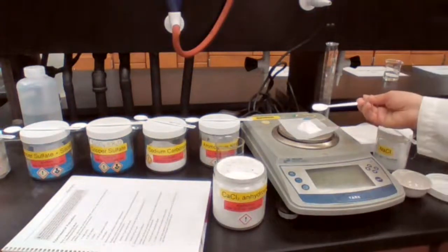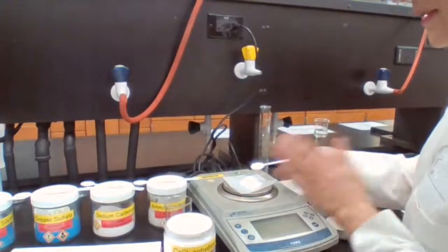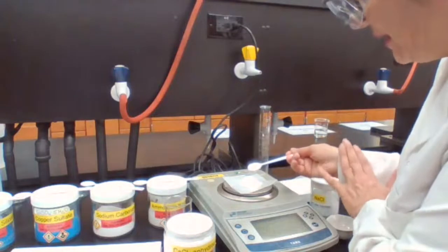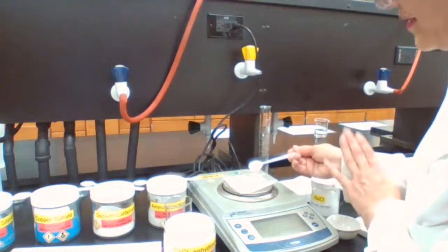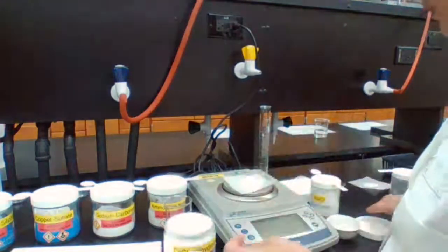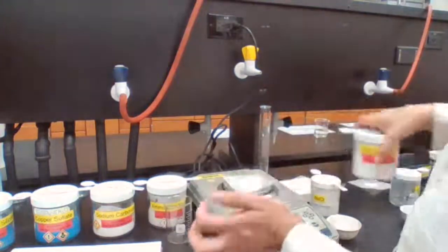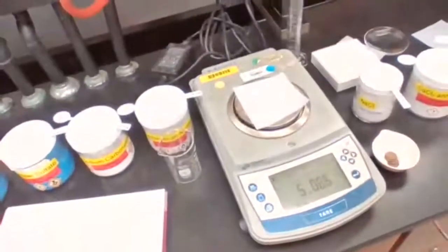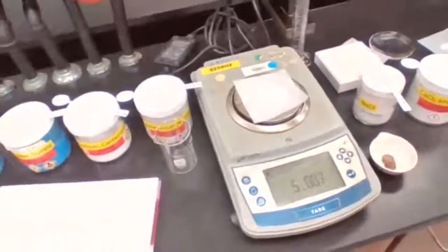The reason you want to close the container right away is that you want to make sure the anhydrous substance does not absorb moisture from the air, because if it does, then it becomes a piece of rock. It doesn't serve the purpose, and the mass is not the mass of the substance by itself anymore. It's going to be the mass of the substance plus the water that it has absorbed. So I measured the 5 grams. See, it fluctuates. It goes up and down because I'm talking, but that is the 5.00 grams of the calcium chloride. We're going to keep that for later on.